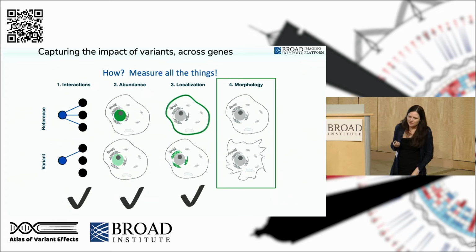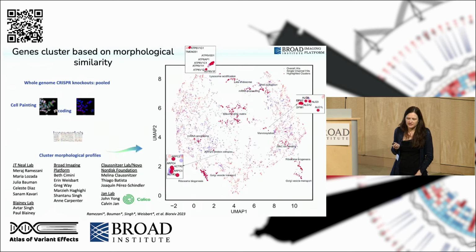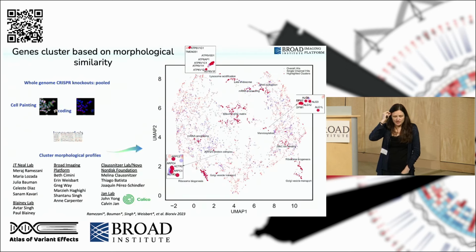All right, now back to the main thread. The last assay is focused more on morphology, so let's take a look at that. Here I will again turn to pooled optical profiling.